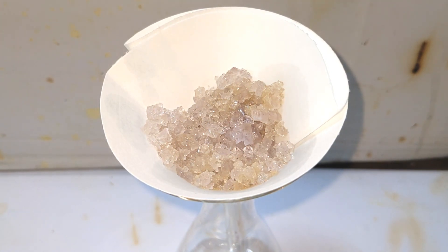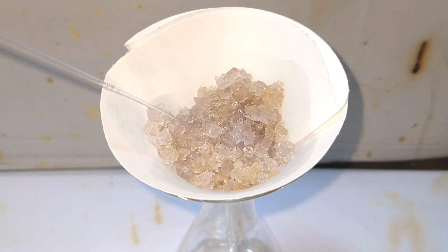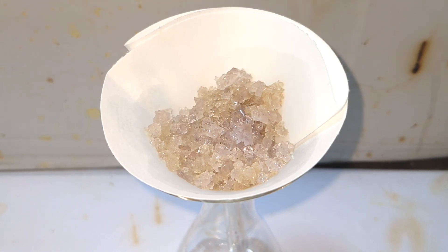This violet color is what theory predicts. If you use an old sample of iron(II) sulfate in this preparation, you might not get this violet color as expected in theory.